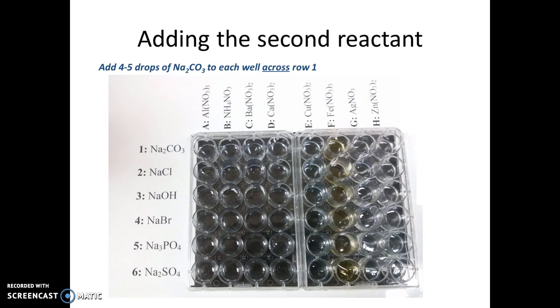To add the second reactant, I'm going to be looking at the rows on the left-hand side, labeled one through six. Starting at row one, which is labeled sodium carbonate, I'm going to find the solution of sodium carbonate in the lab and add four to five drops to each well going across row one—a total of eight wells marked with a red X.